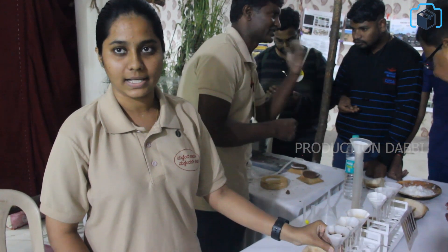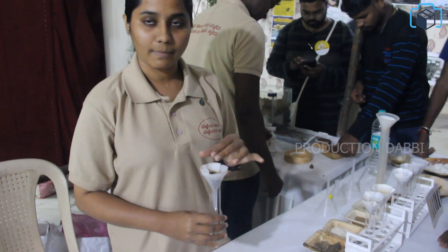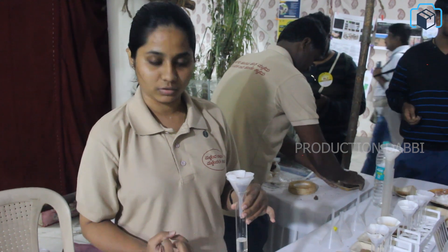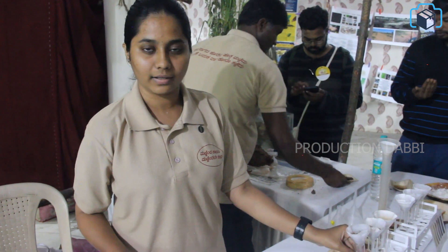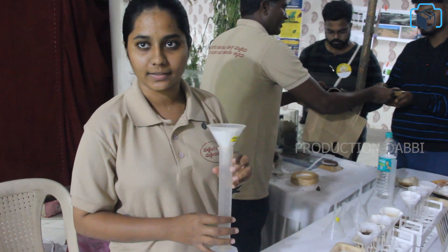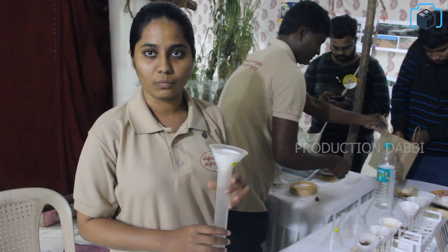Different soil samples are filled into the tubes. There is a filter paper and water. There are graduated tubes. There is 150 grams of soil and 100 ml of water.